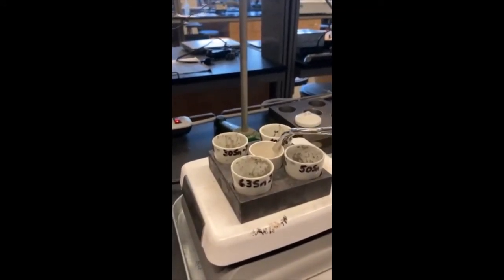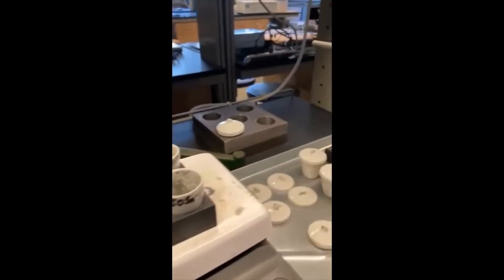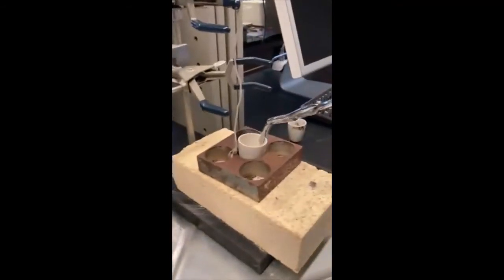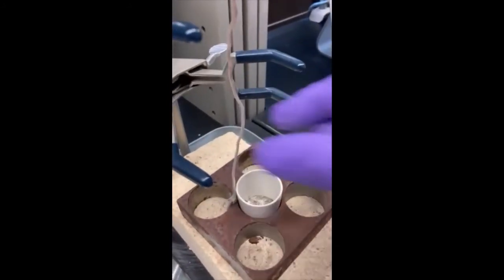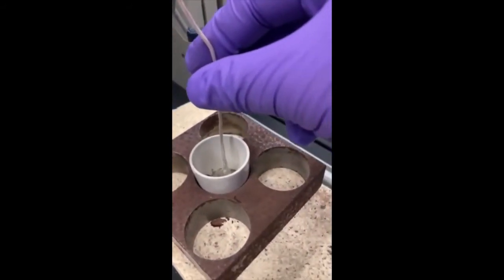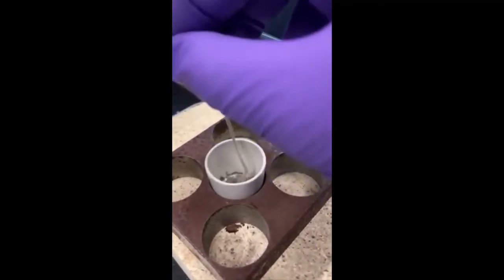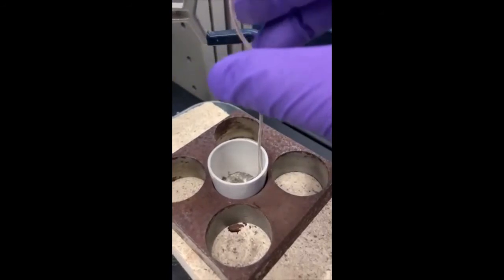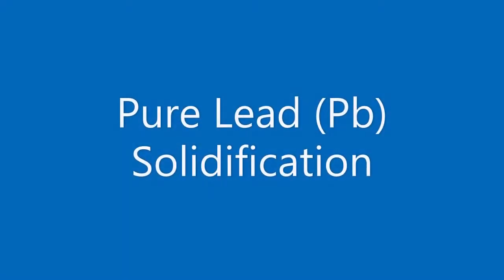To begin the experiment, the crucibles are placed on a hot plate and heated high enough to convert each sample into a liquid. Then the sample is removed from the hot plate and transferred to a second station where we use an insulation brick and a mold to position and secure the crucible, and then immediately insert a thermocouple into the liquid metal. And then as the crucible cools, we record the temperature versus time data on the computer.